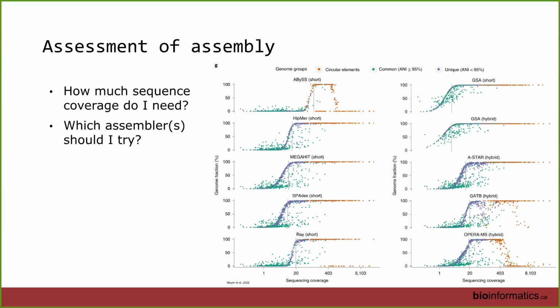So this is a plot. These are all quite small, and so I don't expect you to interrogate them deeply, but essentially this is the kind of plot you get, where each of these facets is a different metagenomic assembler. And what we're looking at is a curve plotted for how much coverage you need for your metagenome for each of these assemblers. Now, I should be clear that these benchmarking data sets are based on fully traceable reads. So they keep track of the reads from the absolute beginning of the process all the way to the end, which allows us to know the actual truth of where these reads should be. And that lets us assess these software in a way that we really didn't get to do before.